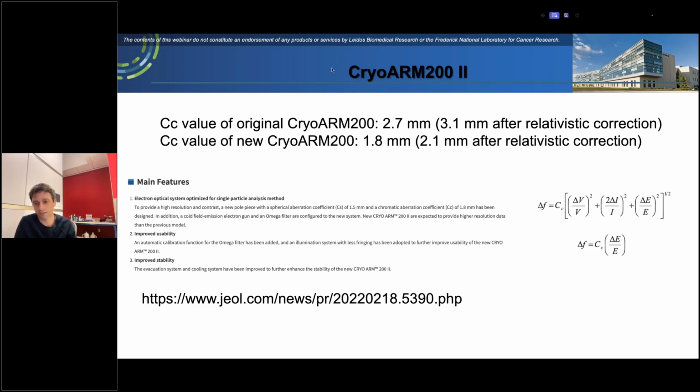It'll be interesting to me, as I watch all these go out, how they perform and how they compare, and for the different use cases, what ends up being the best one. But certainly for us, with the applications we've done thus far, for all the structures I showed today, if we had a narrow gap pole piece, things could only have been better. It's just a question of whether that is limiting us, and time will tell.